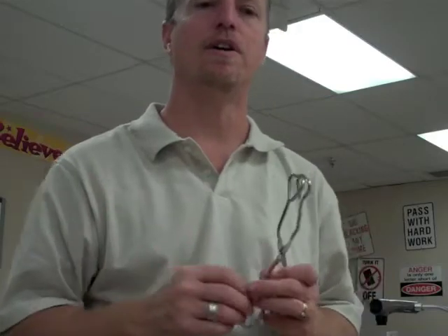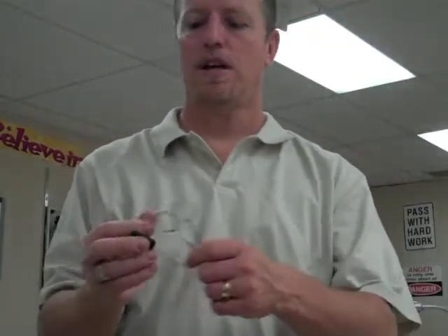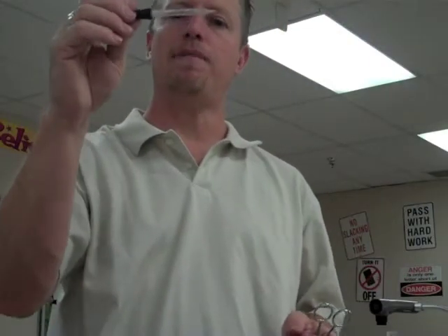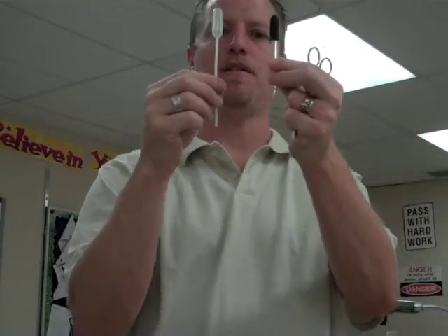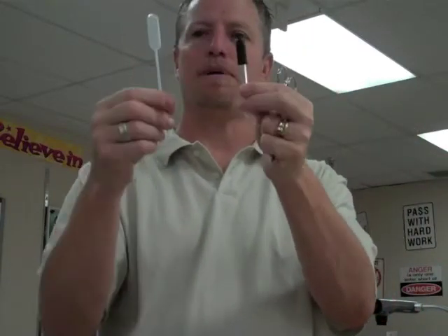These are also items we'll use in dissections. This is a medicine dropper or eye dropper — on the practical it'll probably be called an eye dropper. It's just to move small amounts of fluids back and forth. It's a lot like a pipette, probably not as accurate.